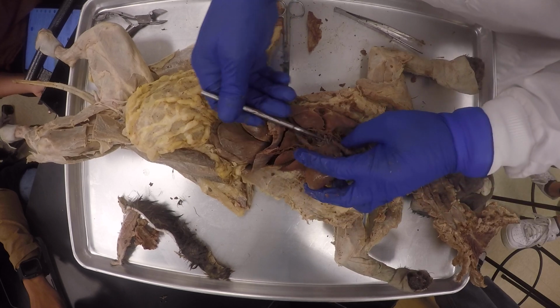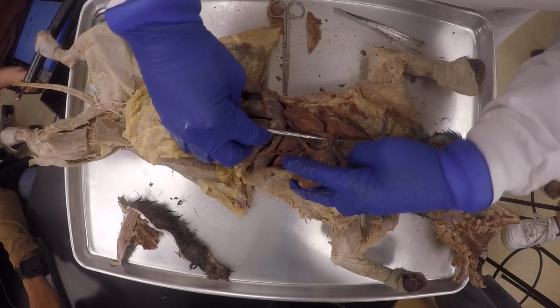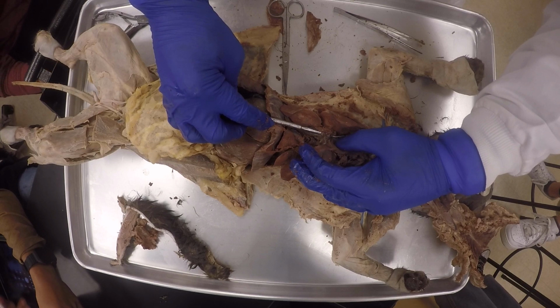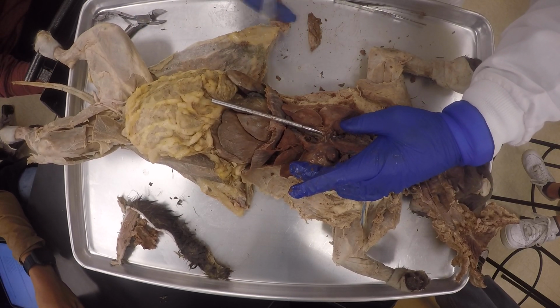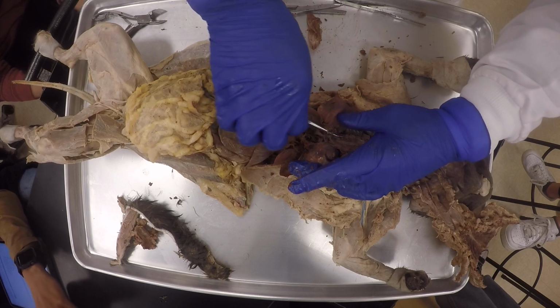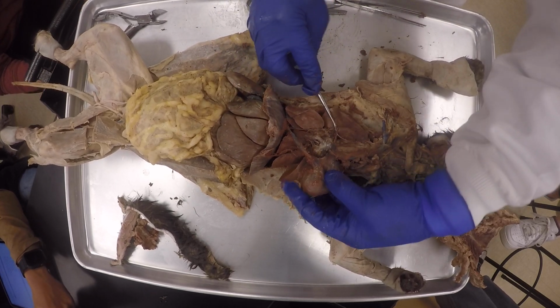So what I'm going to do is just cut these veins and arteries, okay? Be sure to leave the azygos vein. Do you understand me? So I'm going to leave the azygos vein right there. I'm going to leave my little probe in there, and then I'm going to do that. You see what I'm saying? Snippy snip. You see, I just cut off those. And now, as sure as a heart attack, you could see the bifurcation.